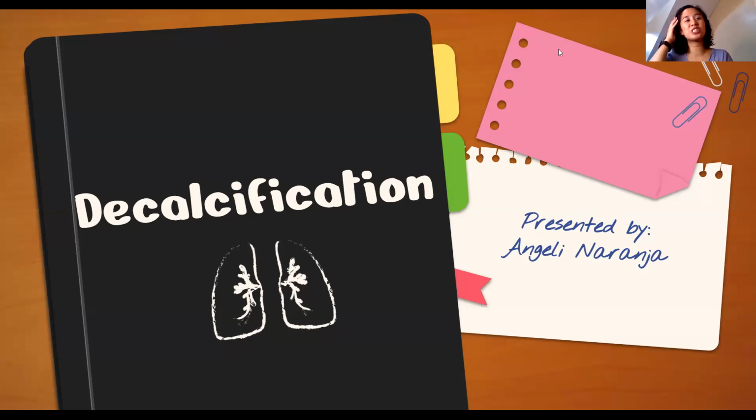Welcome to our next part of tissue processing, which is decalcification. Decalcification is quite special, guys. It's not part of the routine tissue processing. Notice, di ba, it should be fixation, dehydration, but in between the two we have decalcification. So ito isa tong bonus round.